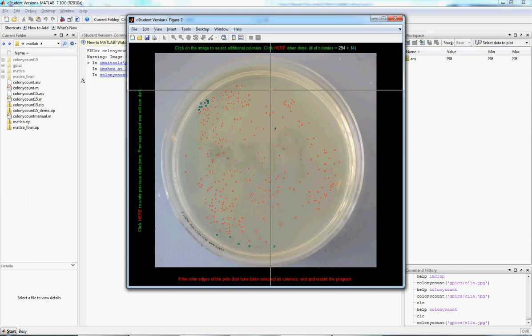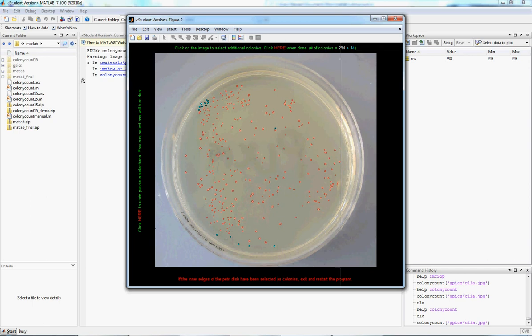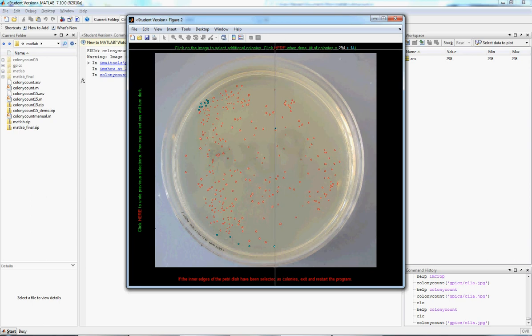So then, when that's good, go up here. It's also keeping track of how many were autocount and how many we've just added.